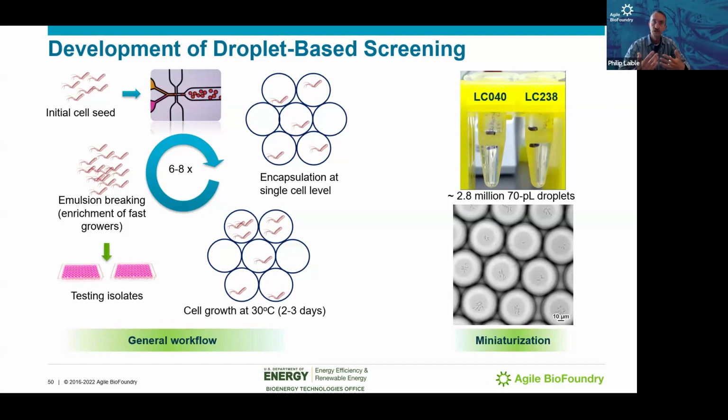If you're looking to evolve your strain into higher and higher levels of certain components of the biomanufacturing process, whether it be the feedstock itself, or maybe the product or intermediates, or some toxic chemical that's in either of those solutions, then you can do this with several rounds and get higher and higher tolerances, with additional mutations being isolated and giving the cells an advantage in these environments. So we set up these cells.